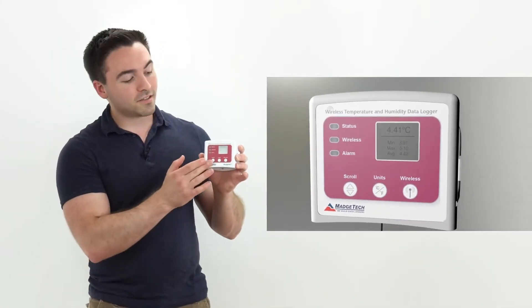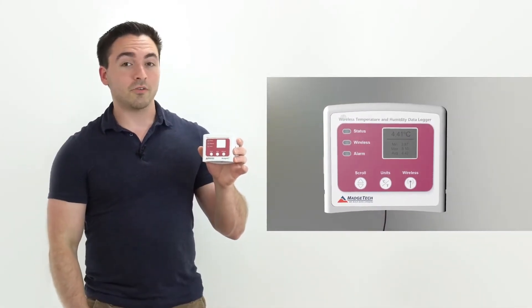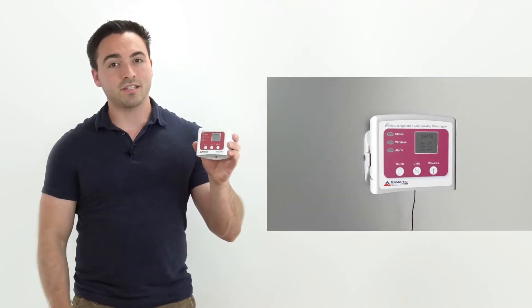The data logger itself features a convenient LCD screen which can display current readings as well as minimum, maximum and average statistics.